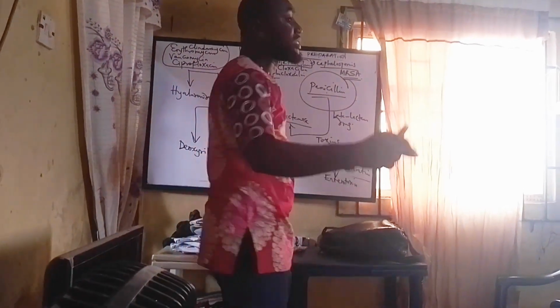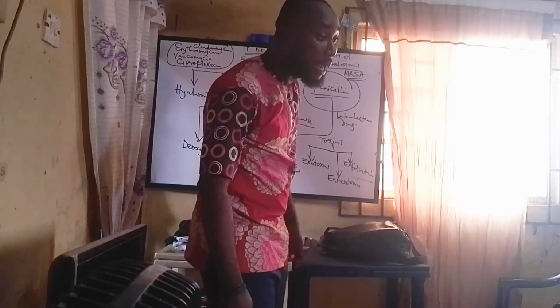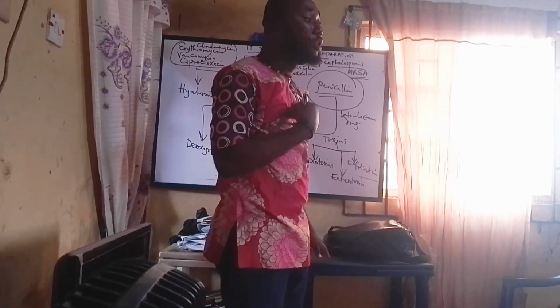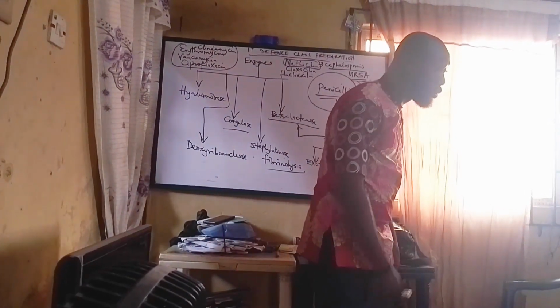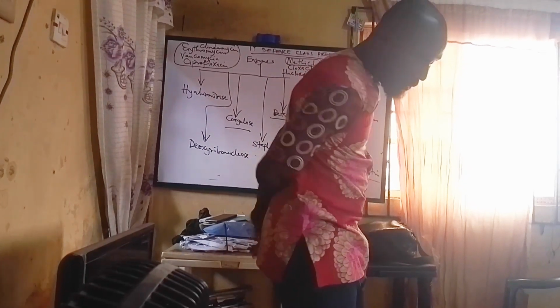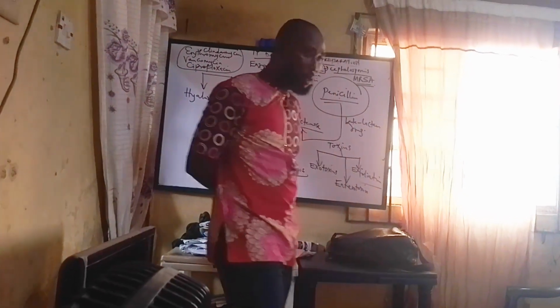So that anytime you are presenting anything on any of these bacteria, you should be able to tell them that you did biochemical test. Are you getting it? Because that is the only way they will believe that you really did the work. Because on your own, only eye gauge is not enough for you to convince your lecturer that this is staph. They will ask you, do you know the other species of staph? Actually, it is staph aureus. So you must say you did coagulase test.